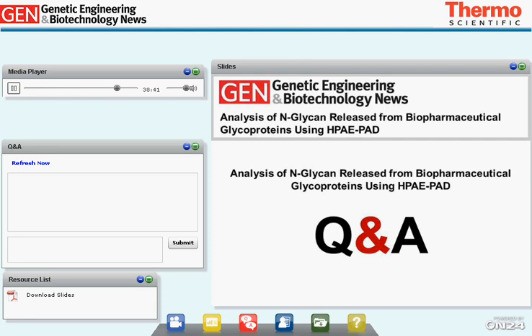For instance, if you have a simple mixture of N-glycans, which is present in some antibody samples, consisting of 10 to 15 different glycan structures, with one main glycan structure representing more than 80% of total N-glycans, we inject about 100 to 150 picomoles of this N-glycan mixture in order to ensure that the main structure is within the linearity.